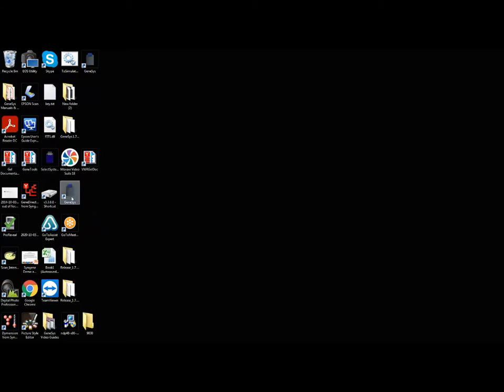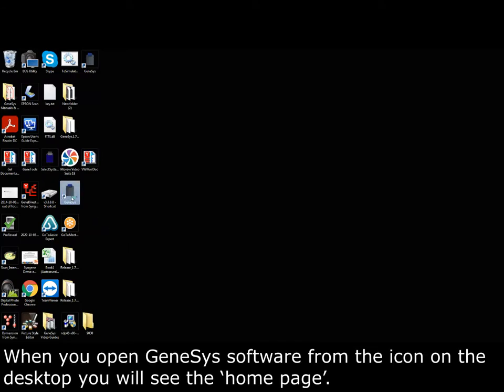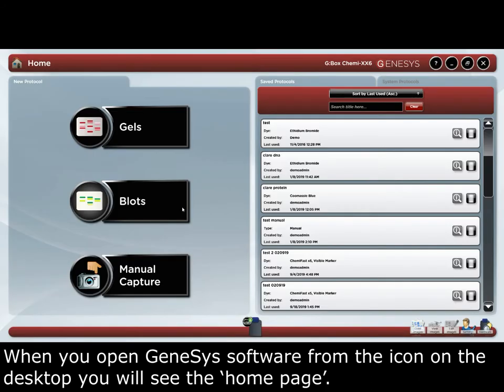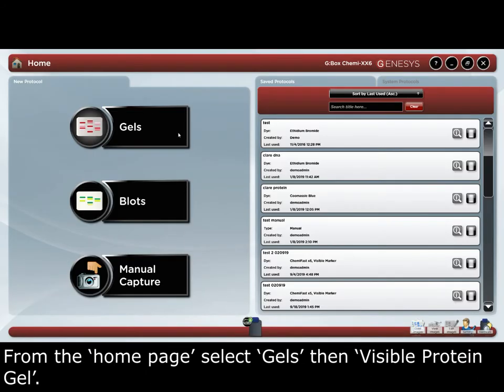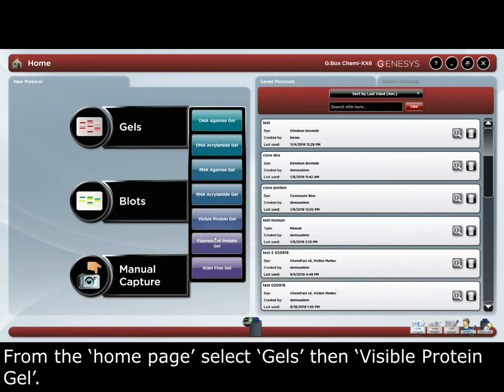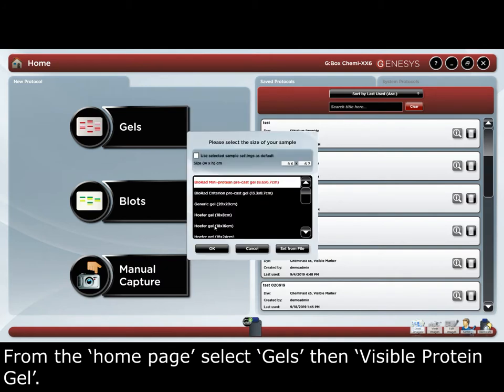When you open Genesis from the icon on the desktop, you will see the home page. On the home page, select Gels and then Visible Protein Gel.